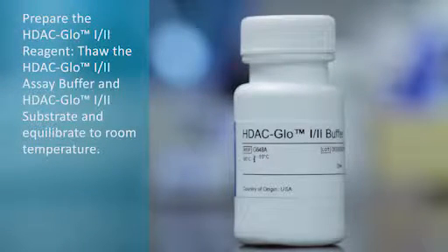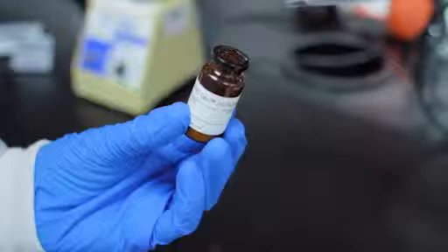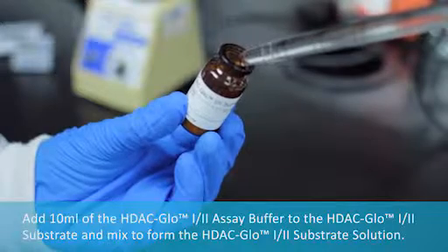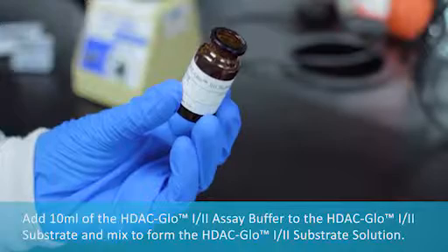Prepare the HDAC Glow 1-2 reagent. Thaw the HDAC Glow 1-2 assay buffer and HDAC Glow 1-2 substrate and equilibrate to room temperature. Add the HDAC Glow 1-2 assay buffer to the HDAC Glow 1-2 substrate and mix to form the HDAC Glow 1-2 substrate solution.